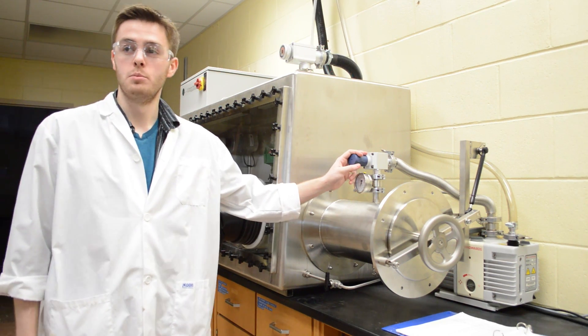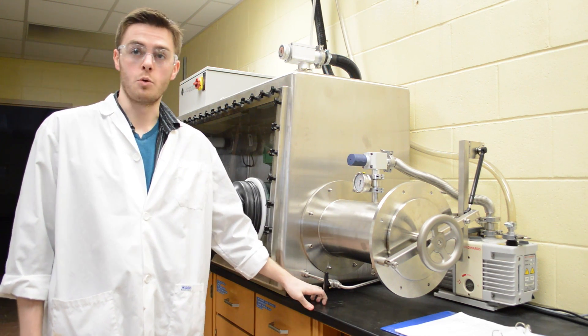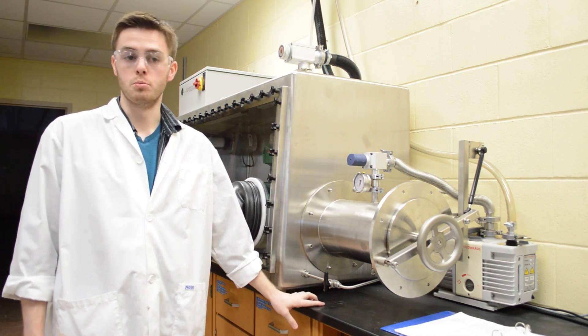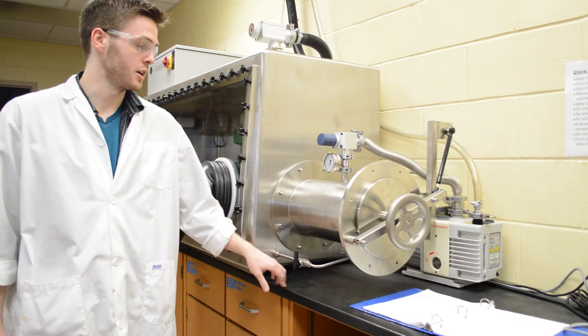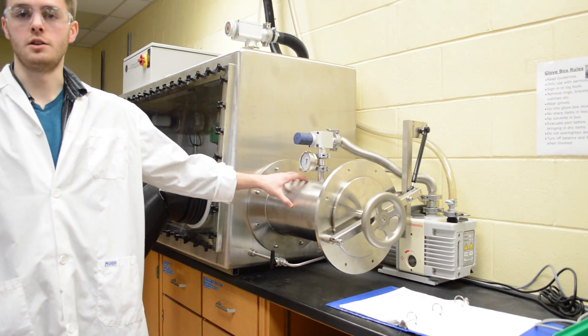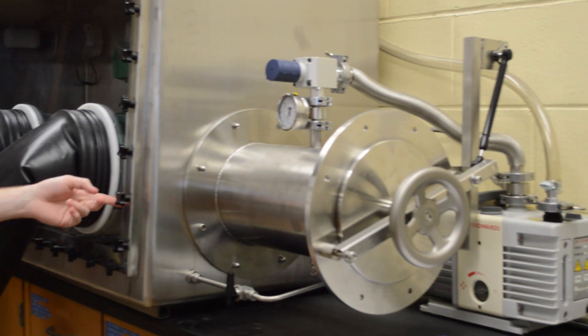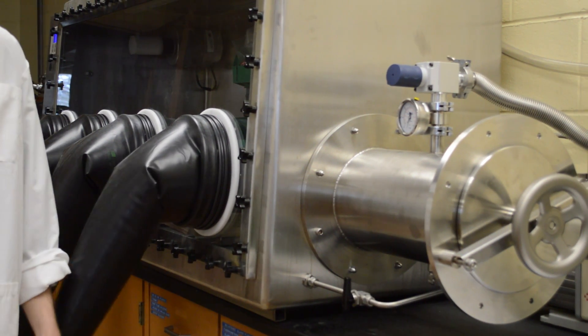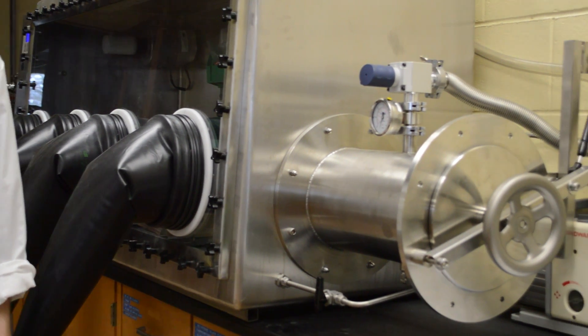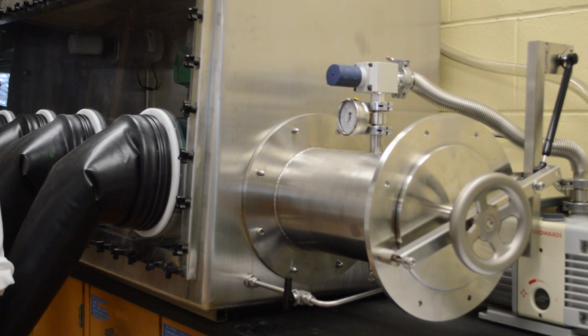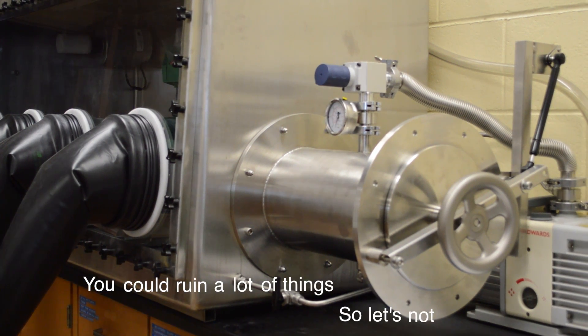When using a glove box, a lot of times what you need won't actually be inside of it. So we're going to bring in our vessels that we'll be using for reactions later on. Right now this anti-chamber is under vacuum, so before you bring anything in, you want to make sure that the door on the inside is sealed, because when you get any air inside the glove box, it's going to ruin a lot of things.